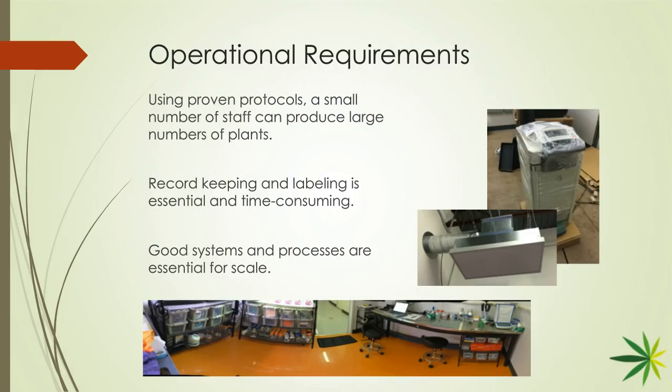So make sure you understand the amount of time it'll take. It also changes your production schedule because the time from cut to soil in micropropagation is much longer. So build up a large mass of cultures in that time. You've got to build that backlog, allow those to bulk. Honestly, that's the first and second one. It's that important, and it's that easy to get wrong.